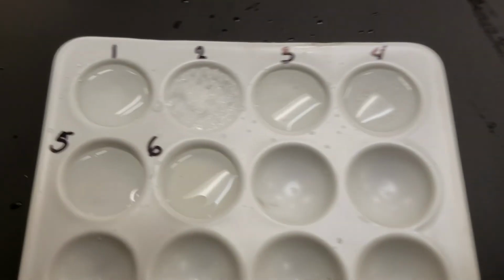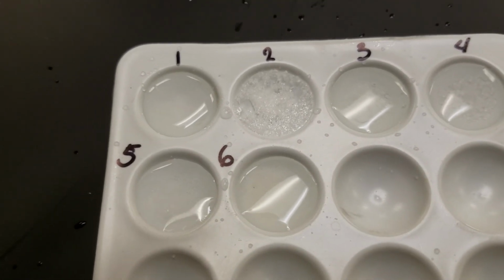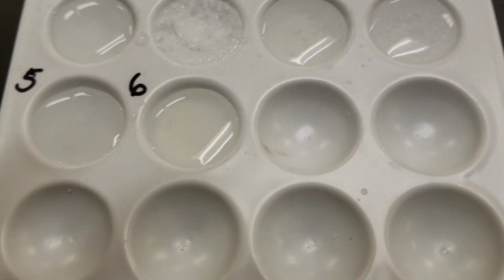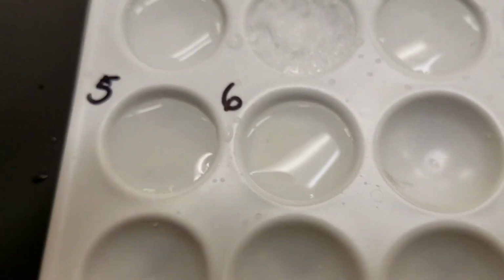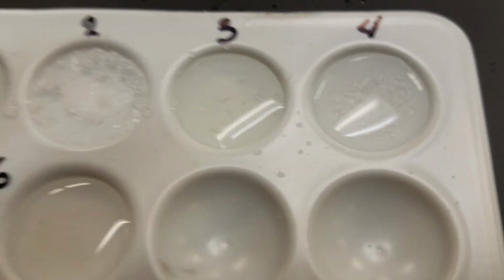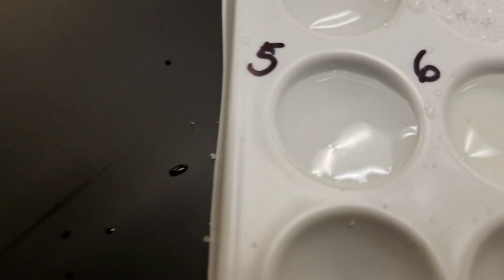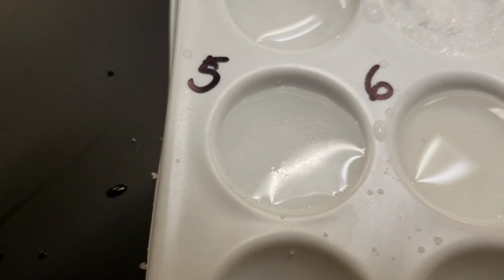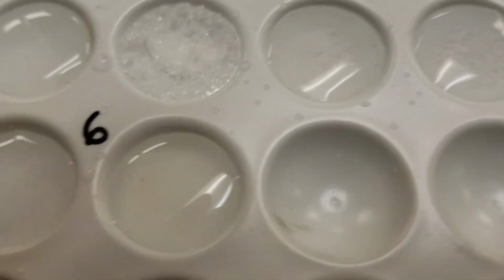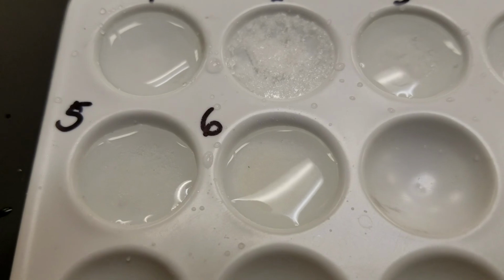So going back to look at them all, number 1, calcium chloride, all of it dissolved. Number 2, phenyl salicylate, none. 3, potassium iodide, it looks like it partially dissolved. 4, maybe some dissolved for sucrose, it doesn't look like much though. 5, sodium chloride, most of it dissolved. And number 6, ascorbic acid, it looks like it partially dissolved as well.